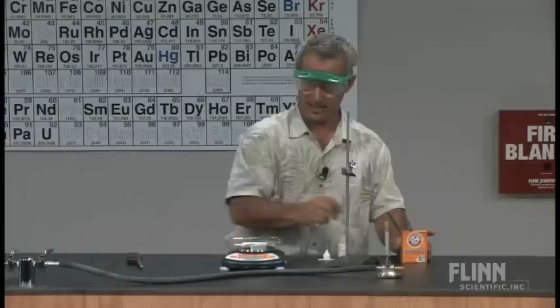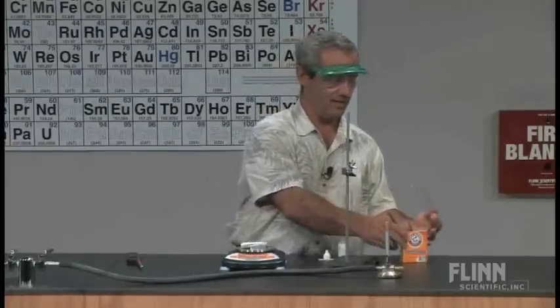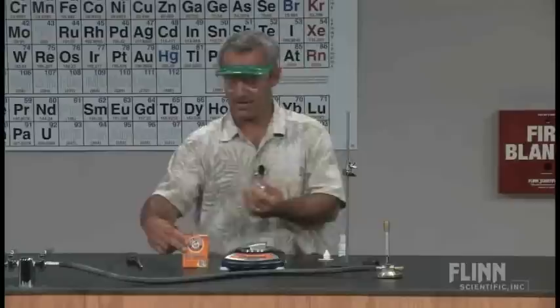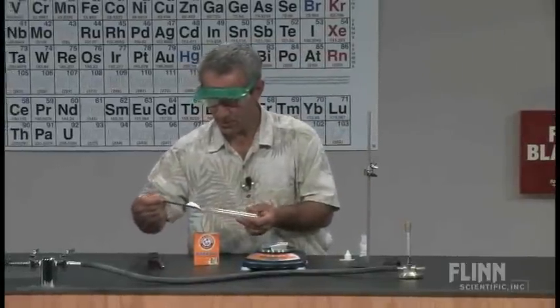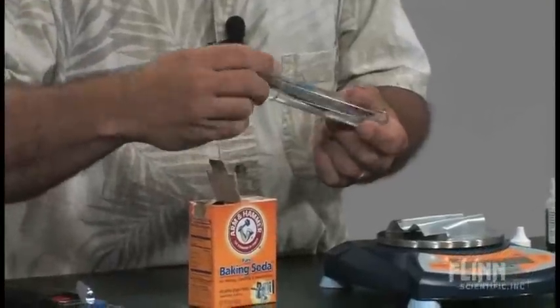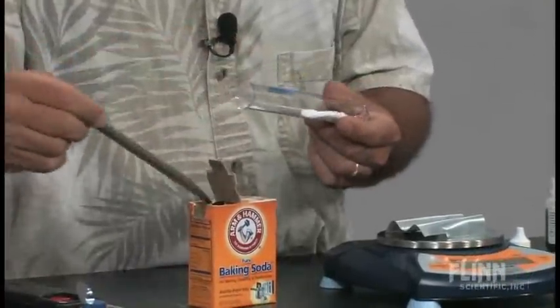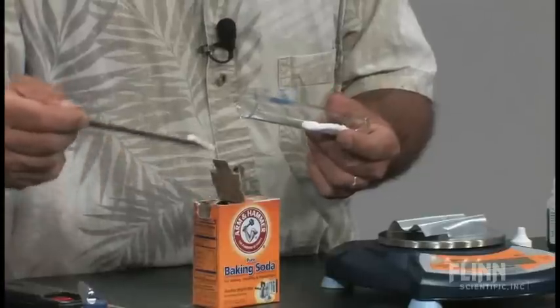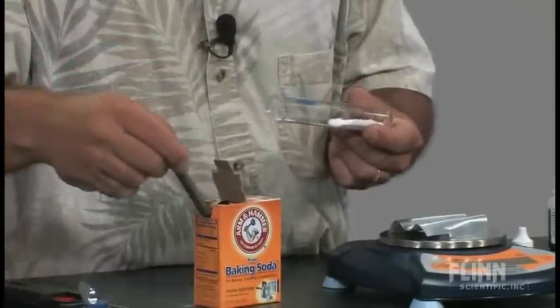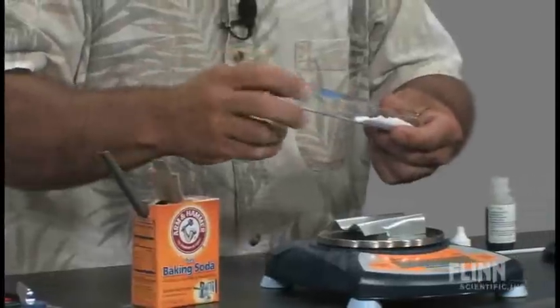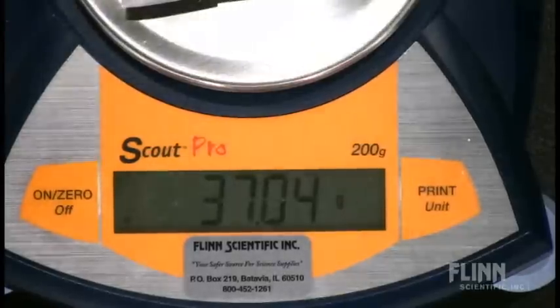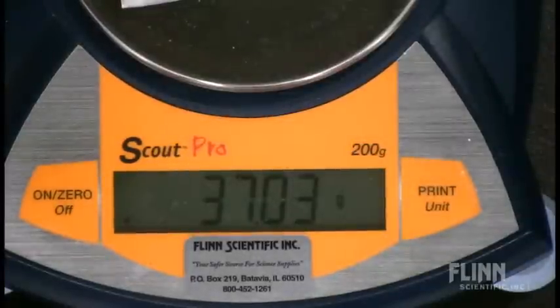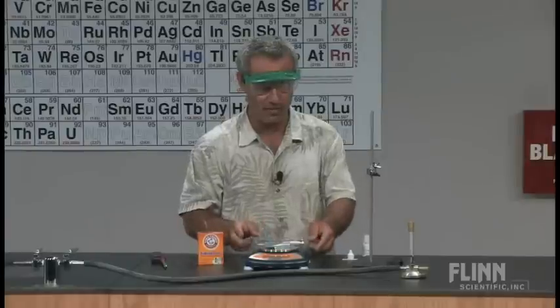What I like best about this lab is that it involves common household baking soda, sodium bicarbonate. We're going to put a scoop of that in there, maybe a scoop and a half. And they weigh it again. This now weighs the mass of the test tube and the baking soda, 37.04 grams.